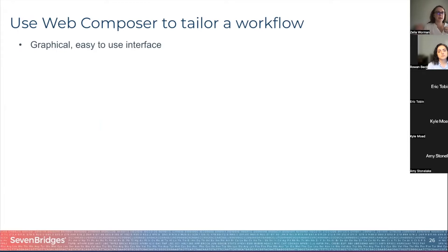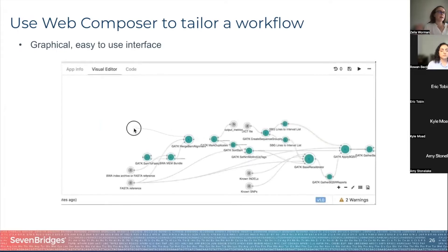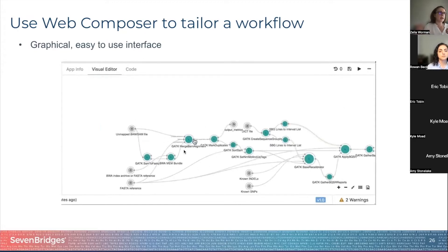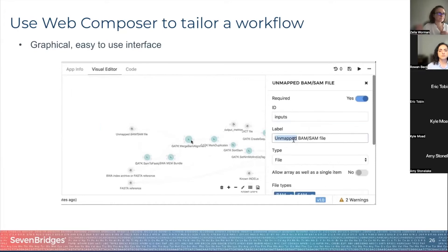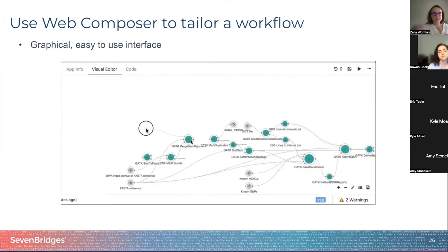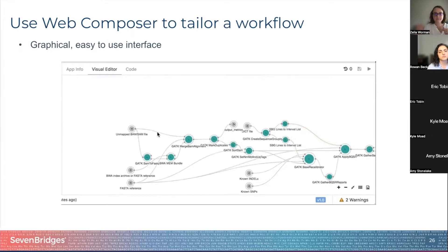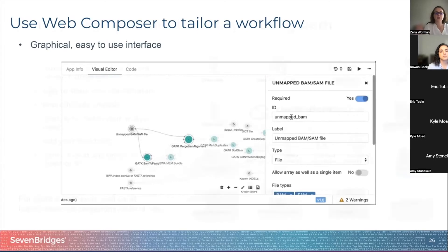You can easily create your own workflow by connecting the applications we have available. For example, here we showcase the GATK: green dots are tools, gray dots are files, and you can see an unmapped BAM file being dragged and dropped as input to two different tools that were not previously connected. If for some reason we don't have what you need out of the box, you can build it very easily, and if you're not sure how to get started, you can always attend Office Hours where we are happy to answer your questions.